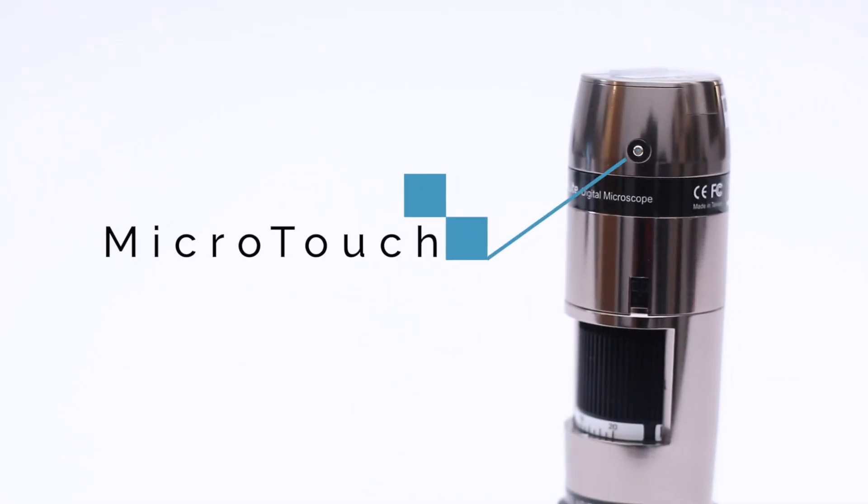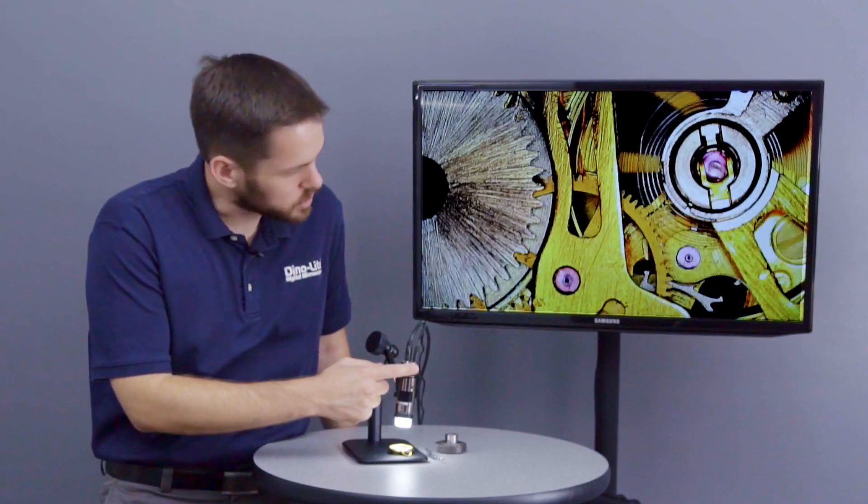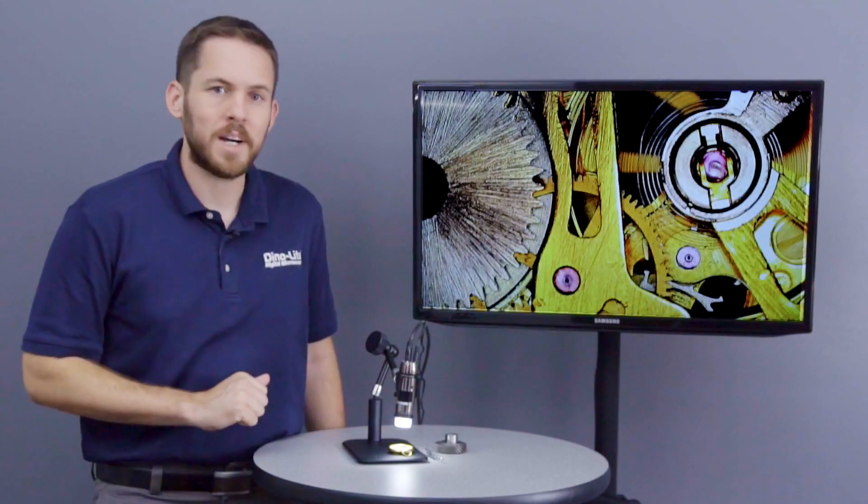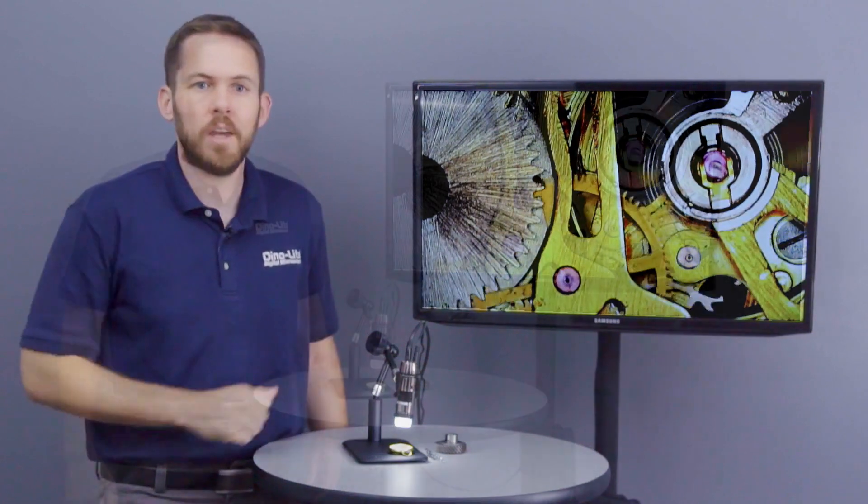Let's go over the micro touch button in more detail. To pause the image, simply hold it for a brief time, and it will pause. To resume the image, repeat that again. A brief touch, and now you're moving again.